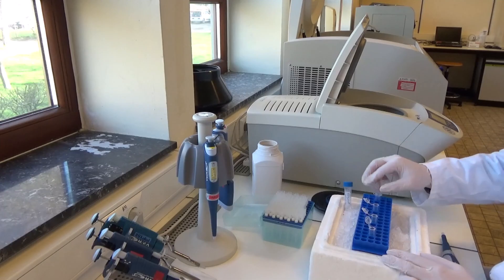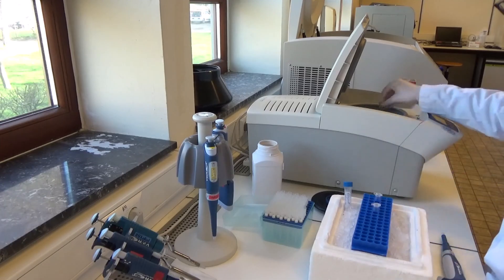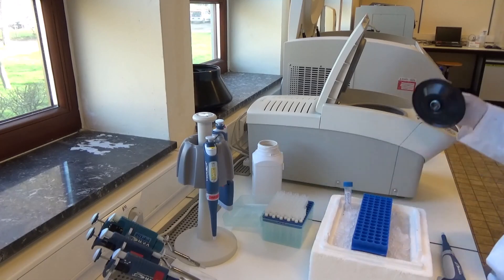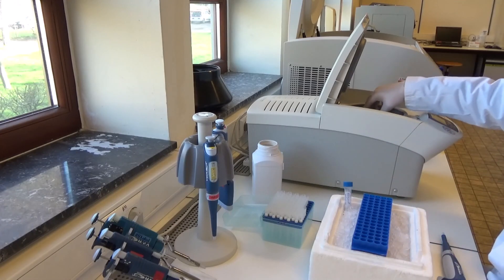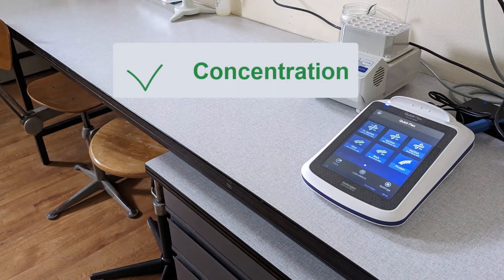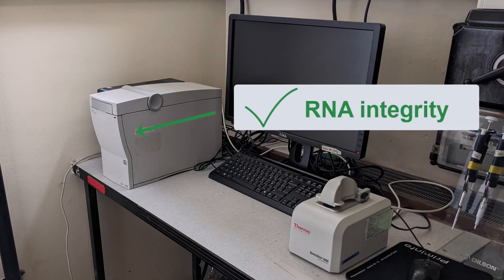To ensure low risk of RNA degradation due to temperature, samples are kept on ice all along the extraction protocol. After the extraction, RNA yield and quality are verified according to several methods: Qubit for concentration, Nanodrop for purity ratios, and eventually Bioanalyzer for RNA integrity for further characterization such as HTS analysis.